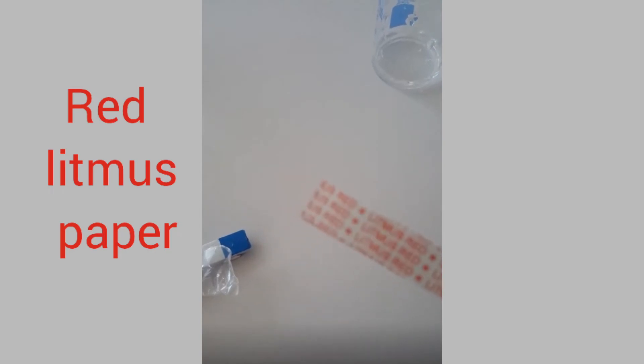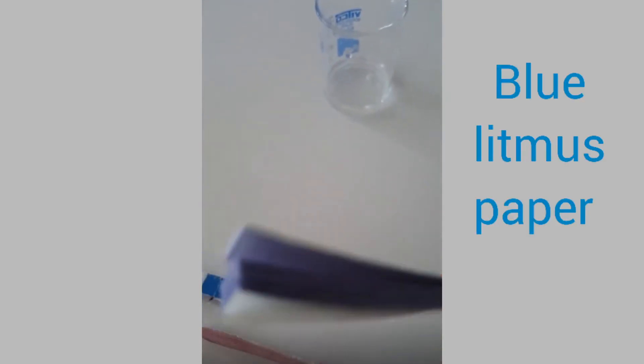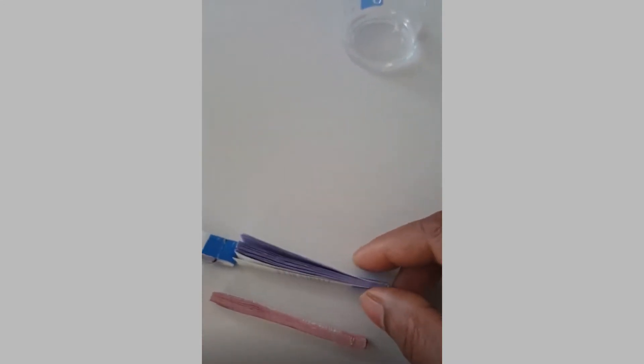I have taken litmus papers. One is red litmus paper that you can see in the video and the other one is blue litmus paper. These are the two litmus papers easily available in the lab to identify the unknown solutions.